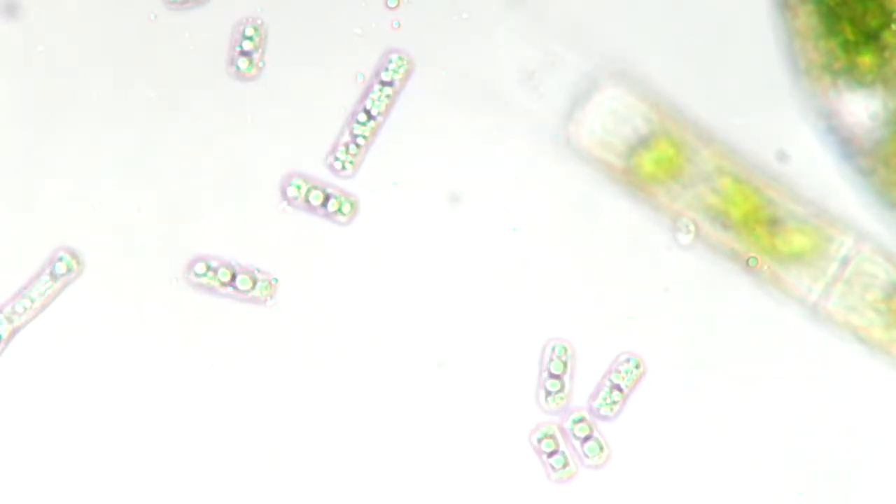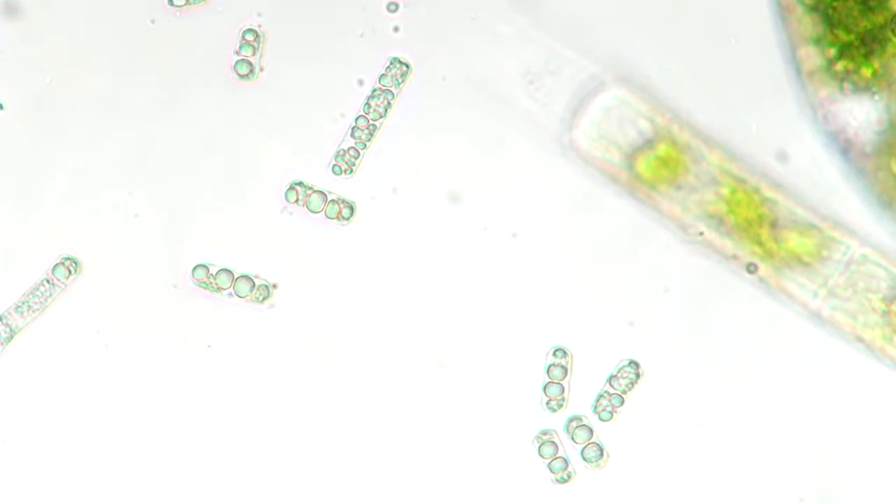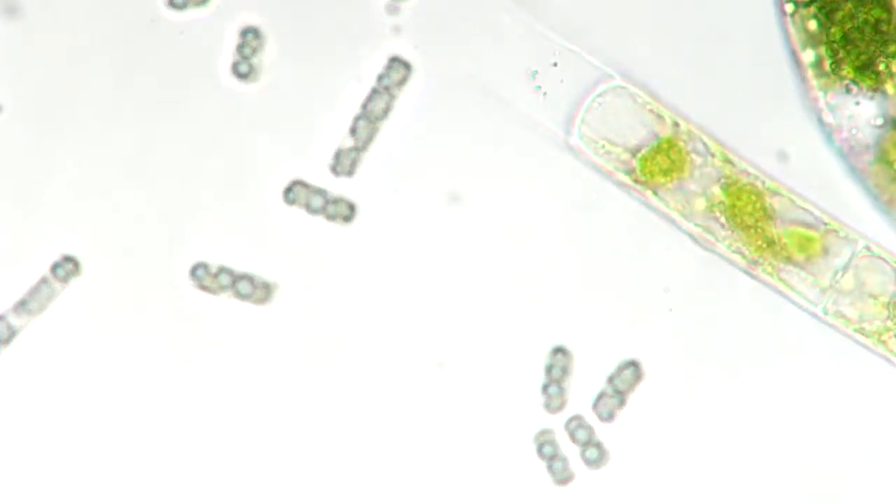And look at these guys. That is Eulithrix — chock full of starch. Those big globular things in there? That's all starch. Fat little guys. I'm going to have to grow those in nutrient-free media.